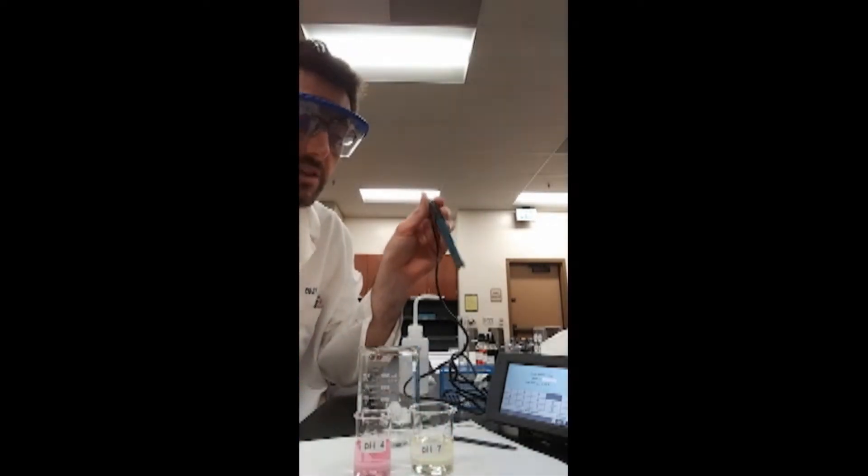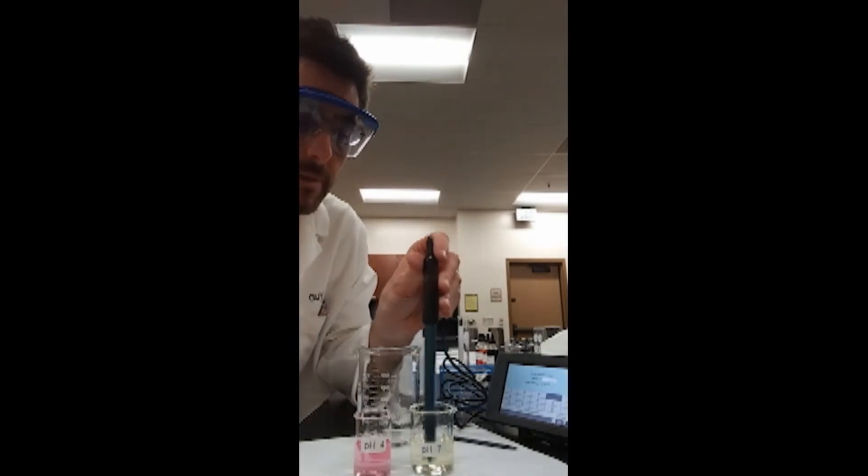Once I've blotted the water away, I dip the probe into the pH 7 buffer solution and I swirl.